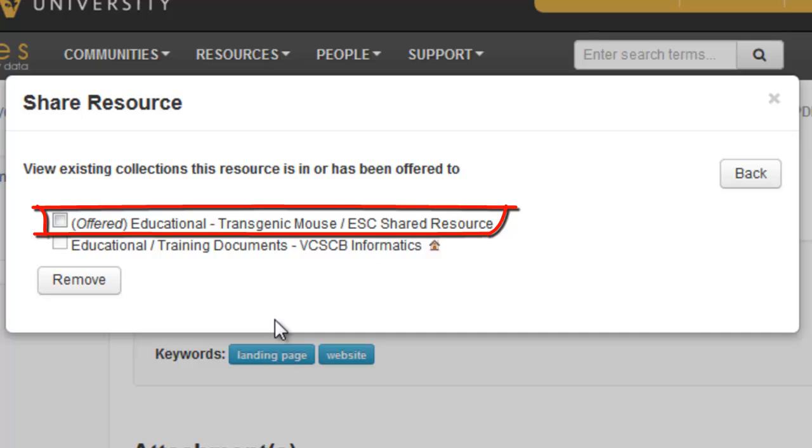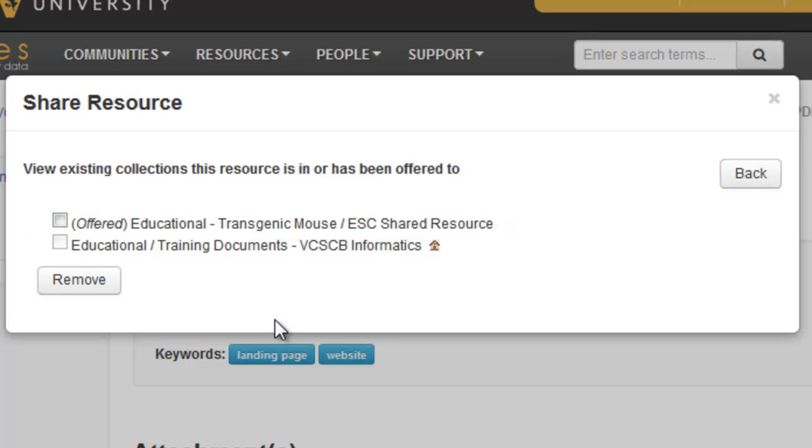The owner of this community will receive an email letting him or her know that you have offered the resource, and they will accept or decline the offer. This concludes the tutorial on how to share resources.